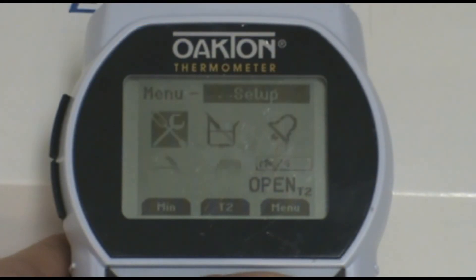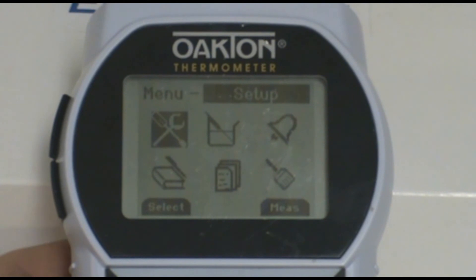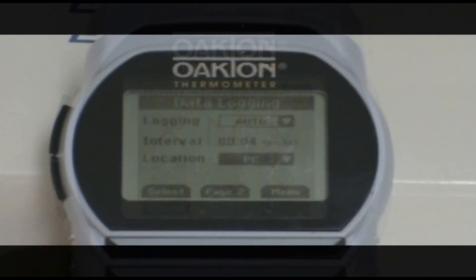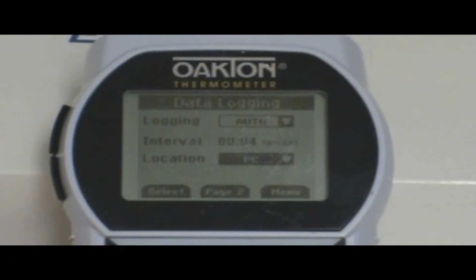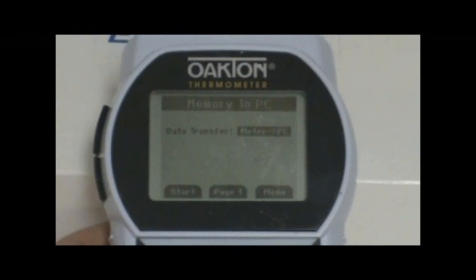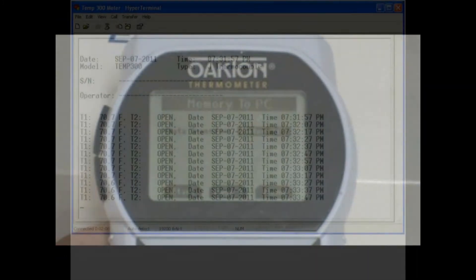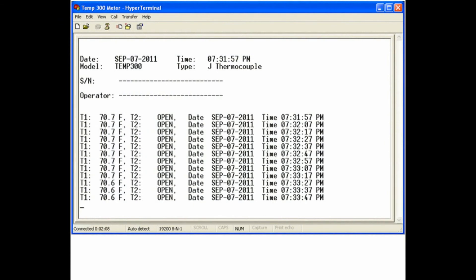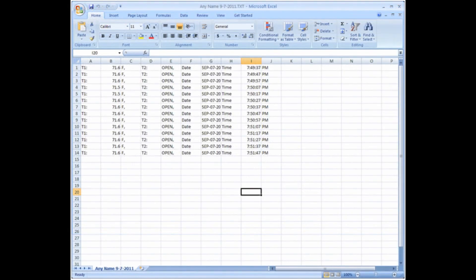You will then need to access the data logging menu on the meter. On the first page, change the location to PC. Then press the Page 2 or F2 button to access the second page. Press the Start or F1 button to begin transferring the data. Your data should then be transferred to HyperTerminal and should look like the sample data shown in the video.